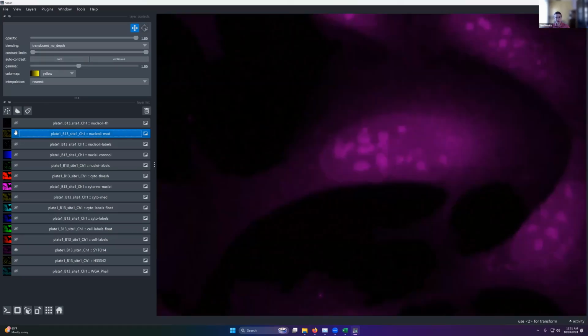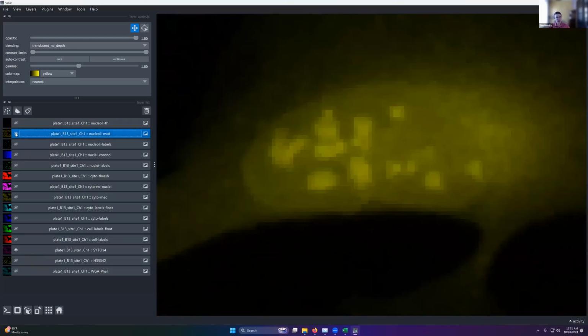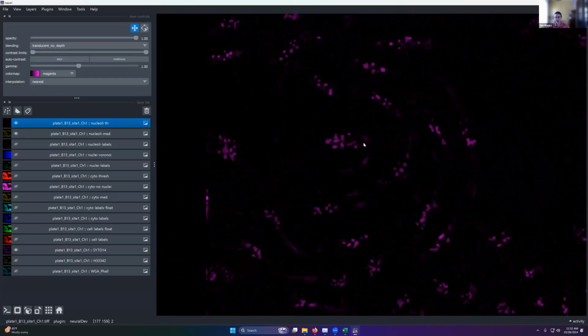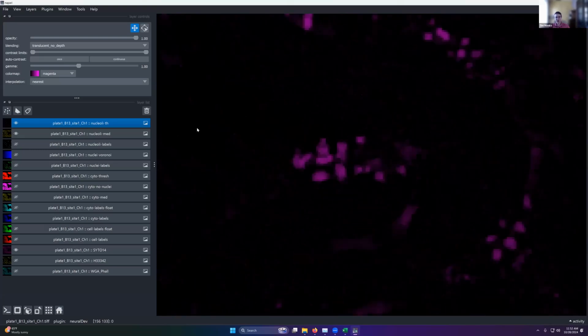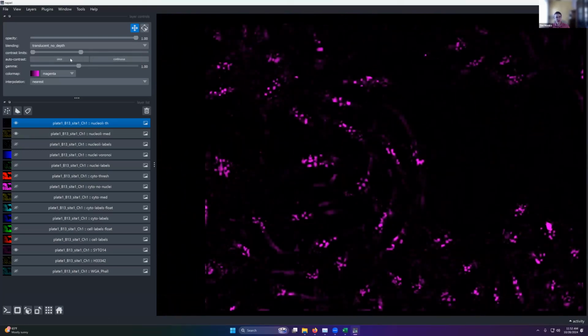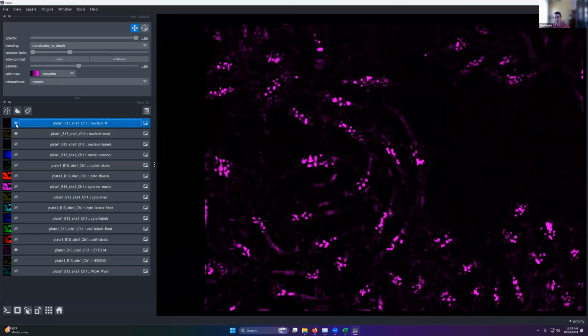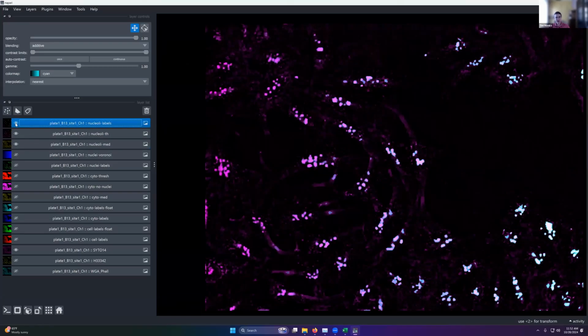So there we go. No blur. Now we have that. So we reduce noise. And on top of that, we're going to do a top hat. So what does a top hat do? It kind of reduces the background here. You can see that background is just gone now, right? Where did all of that go? That's a beautiful thing about preprocessing filters. So then when we segment them, it looks like this.